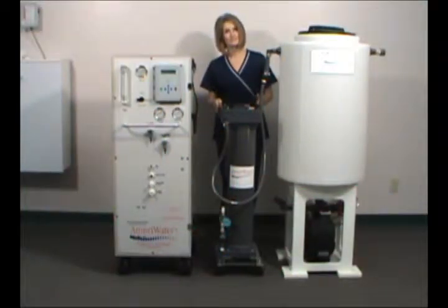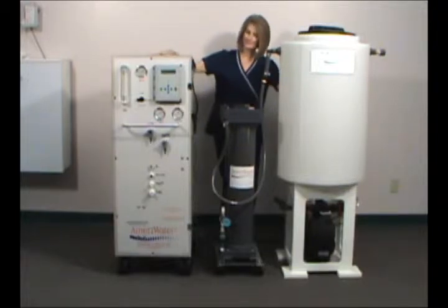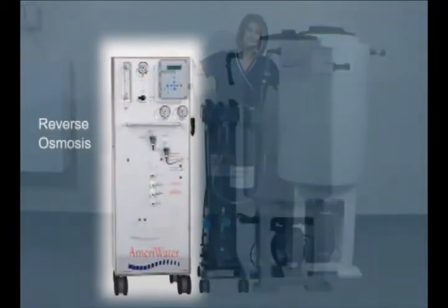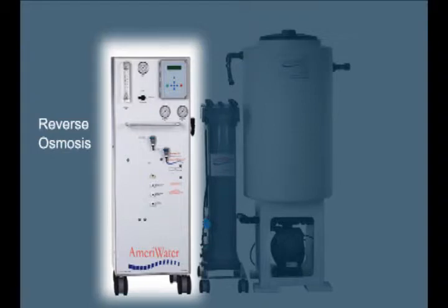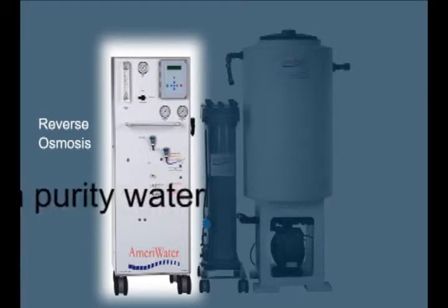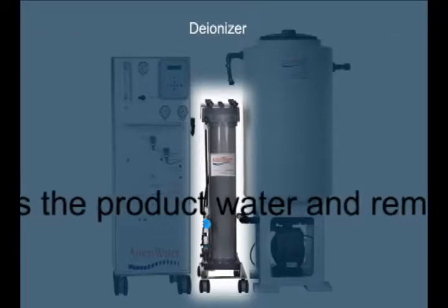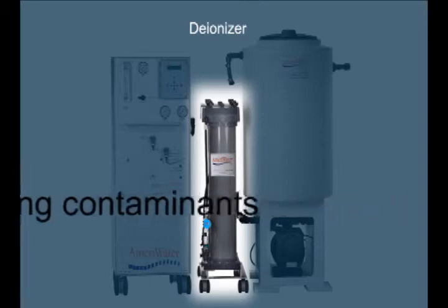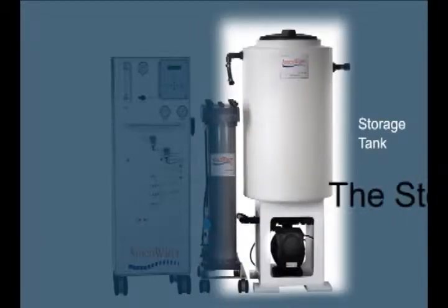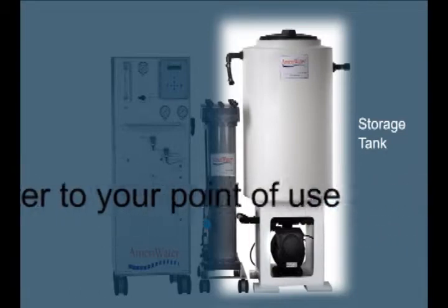AmeriWater's high purity water system is a complete, compact and economical solution to most health care water needs. The system consists of three components. First is the reverse osmosis with pre-treatment, the primary source for providing high purity water, removing most contaminants. Second is the deionizer, which polishes the RO product water. Third is the storage tank and distribution pump, which moves high purity water to your point of use.